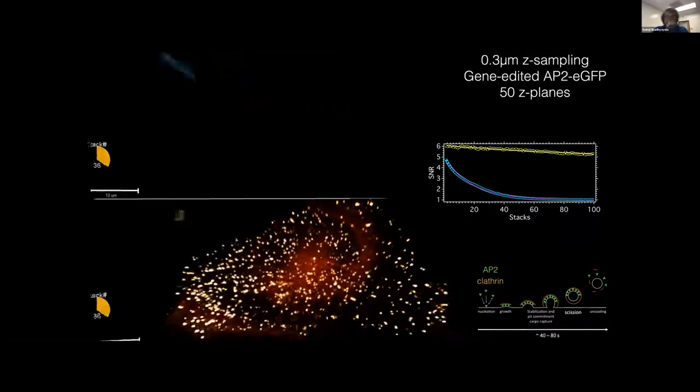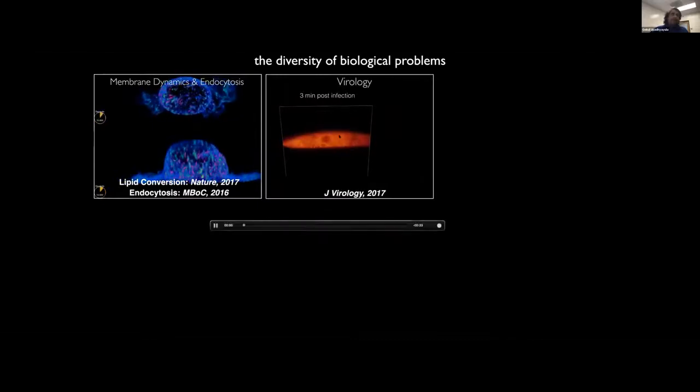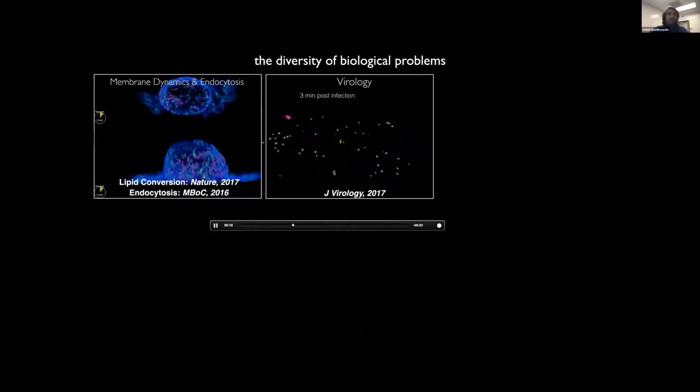So with this, we apply this technology to a host of different problems over the years. We've looked at how phosphoinositide conversion takes place at the site of endocytic vesicles. We've looked at how viruses start to internalize into these cells.